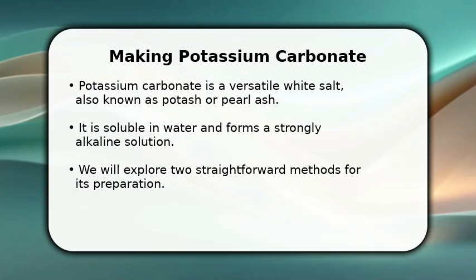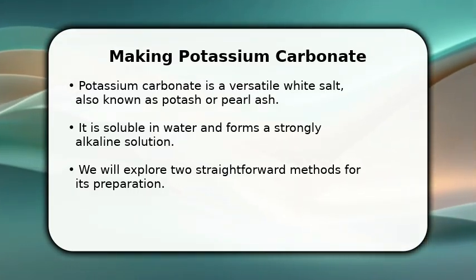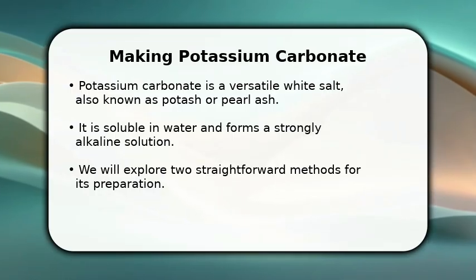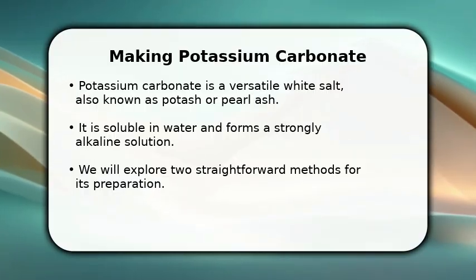In this video, I will explain how to make potassium carbonate. This valuable compound, also known as potash or pearl ash, is a white, water-soluble salt that forms a strongly alkaline solution. It has numerous applications, from making soap to acting as a leavening agent.